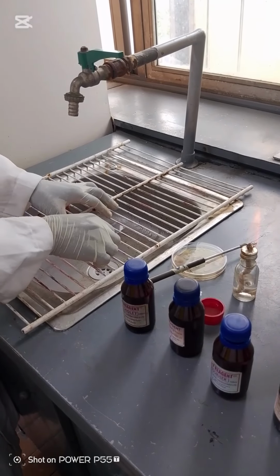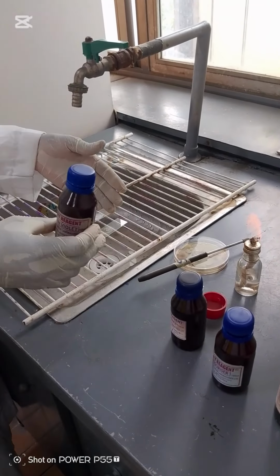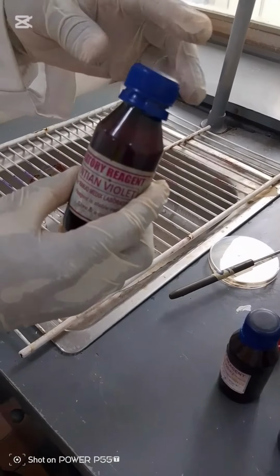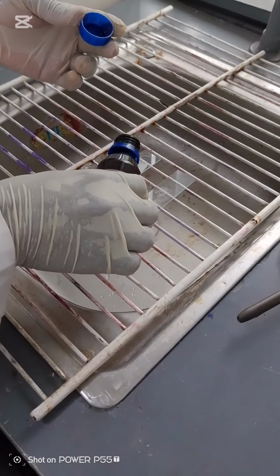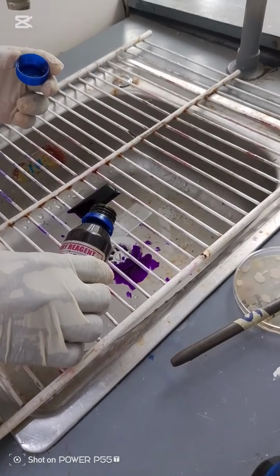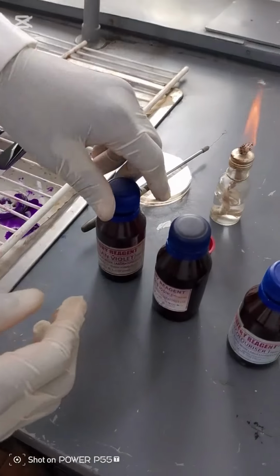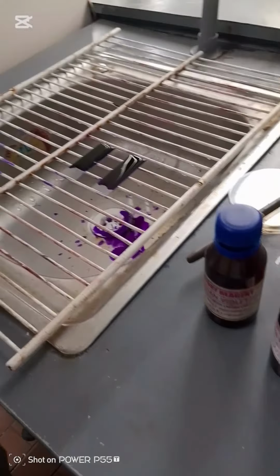Now we want to start the staining proper. The first thing you do, you flood your smear with crystal violet or gentian violet. It's a primary stain and it's purple in color. You flood your smear with crystal violet and allow it to stay for 60 seconds so that the bacterial cell can absorb the stain.